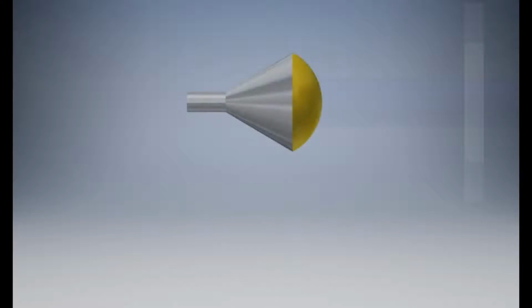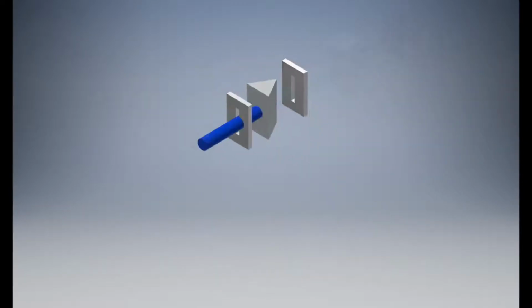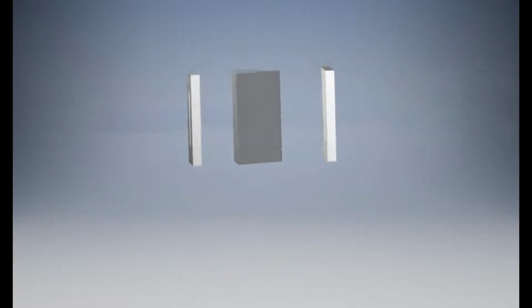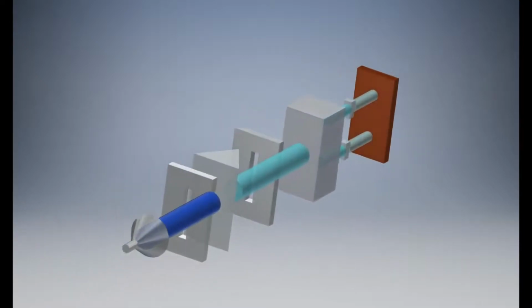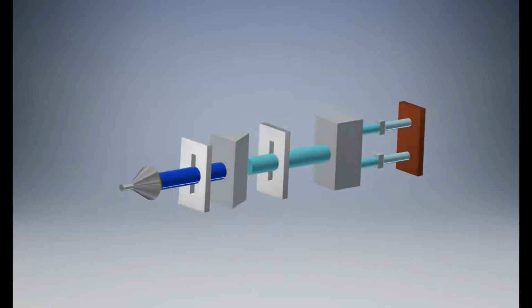In simple terms, there's a light source, usually a hydrogen or deuterium lamp for UV light, whereas tungsten or halogen for visible light. Then the monochromator, which uses the diffraction grating to split the incoming light into the component colors of different wavelengths, like a prism. A beam splitter, which divides the beam of light into two equal parallel beams of light. The sample compartment, which contains both reference and sample cell. And finally, detectors, which convert the impact of photons into electric current that can be monitored by a computer.